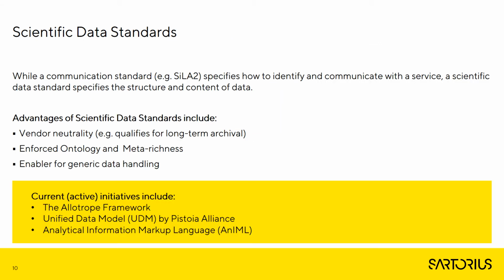While a communication standard like SiLA 2 specifies how to identify and communicate with a service, a scientific data standard specifies the structure and content of data that will be generated. These data standards provide a vendor neutrality, which is especially useful for long-term archival of scientific datasets. Additionally, they enforce an agreed vocabulary and meta richness, which directly enhances reproducibility.